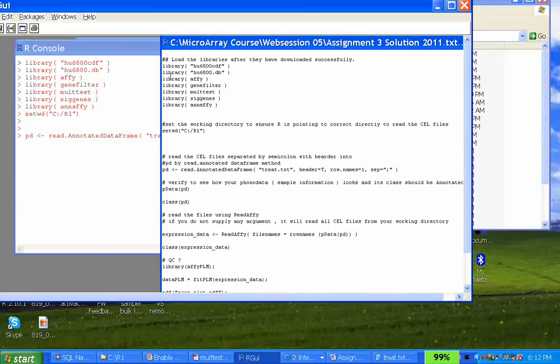Voila, it works, right? So now I'm reading. Any kind of memory intensive process that I want to run in R, you run into that when you do some high performance computing. You obviously are not going to do it from your laptop. You'll probably have dedicated Unix servers and so on to do it. But given the limited resource pool in my laptop, and Wimba probably is built on a Java application, if they are not doing the garbage collection and memory collection optimized, then it's a contention and R just gives up. So enough with Wimba, it doesn't work. Good to see that. So now let's move on with our R program here.